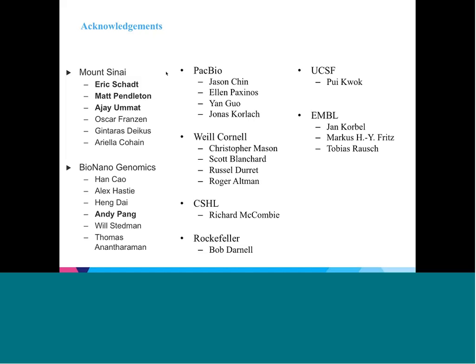Great. The next question is, will the introduction of BioNano molecule maps or genome maps into this three-pronged hybrid strategy effectively reduce project costs by way of decreasing PacBio, for instance, physical coverage targets in your design of experiments? So, I think that's likely true, that it reduces the cost.